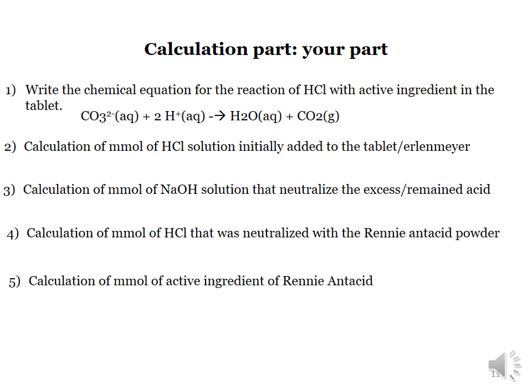Then, after finishing these easy steps, we need to calculate the millimoles of active ingredient of Reni antacid. We will discuss this during the lecture. And the last one is the calculation of the actual value of acid neutralizing capacity.